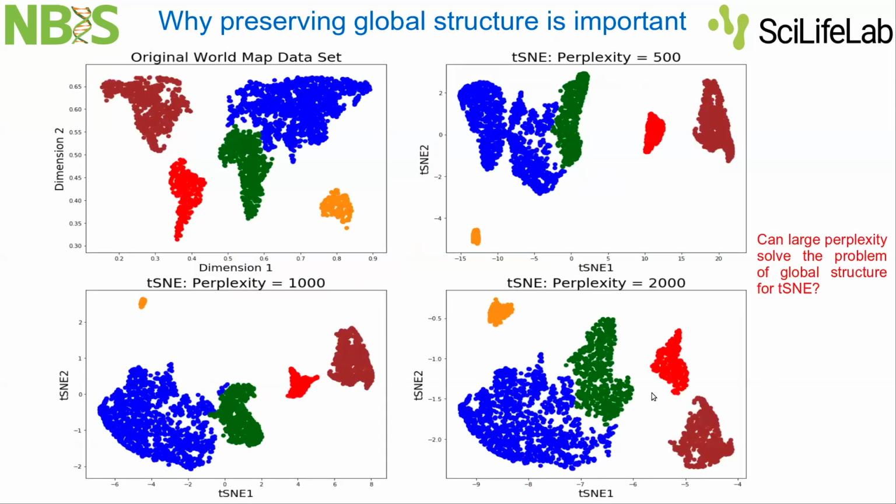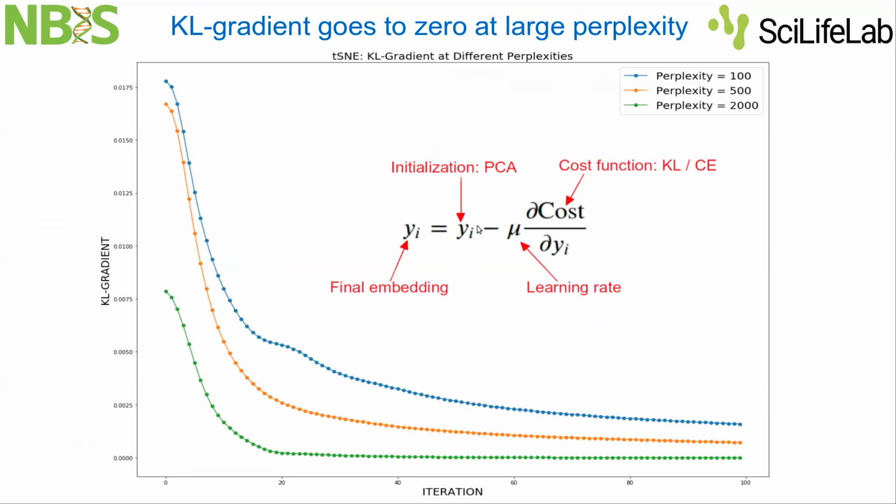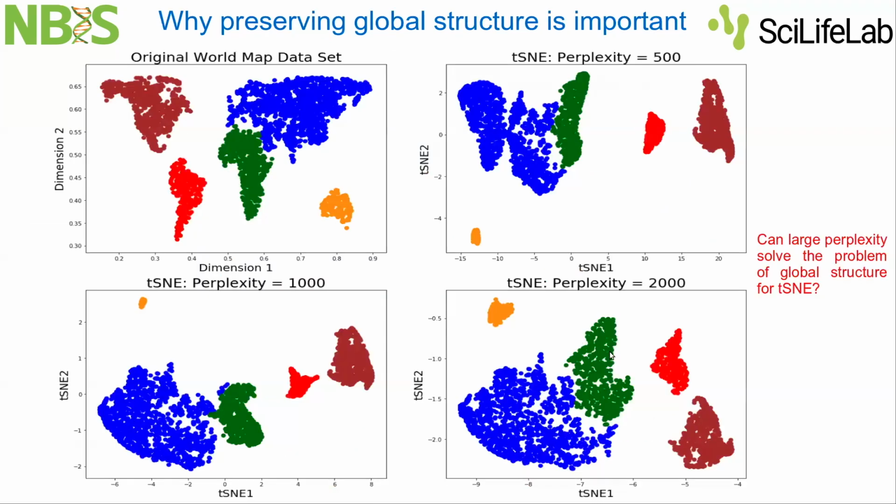the effect that you observe here, why t-SNE actually reproduces the original world map perfectly, is because if you apply initialization with PCA and increase your perplexity up to 2000, like it was here, you actually get a PCA. You don't get a t-SNE anymore. So t-SNE never starts properly.